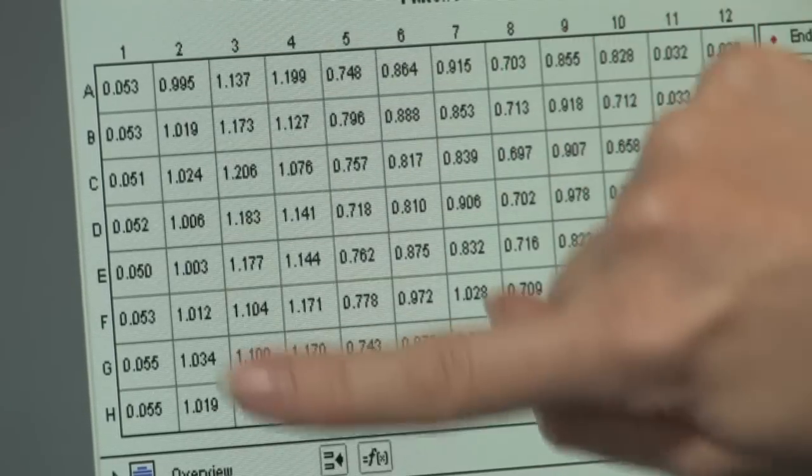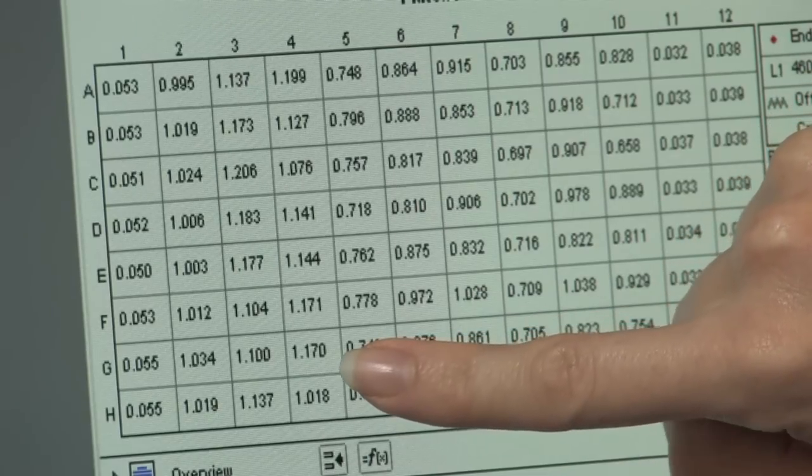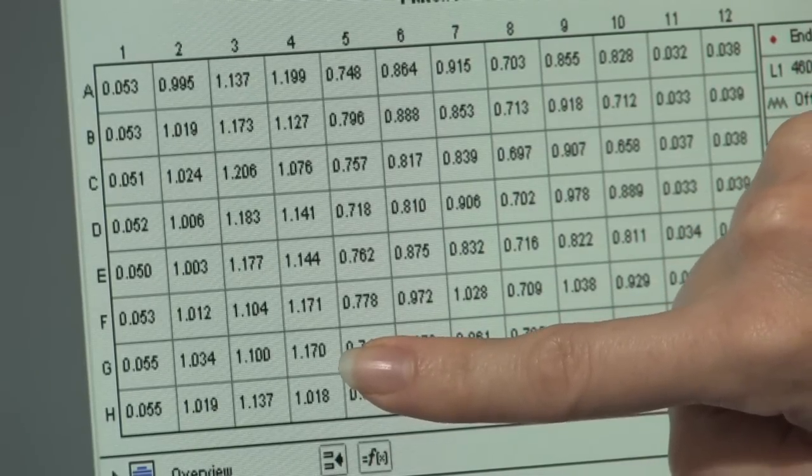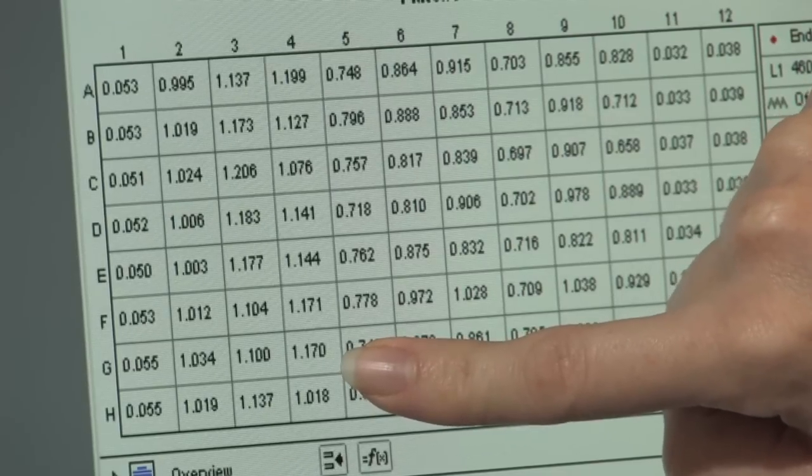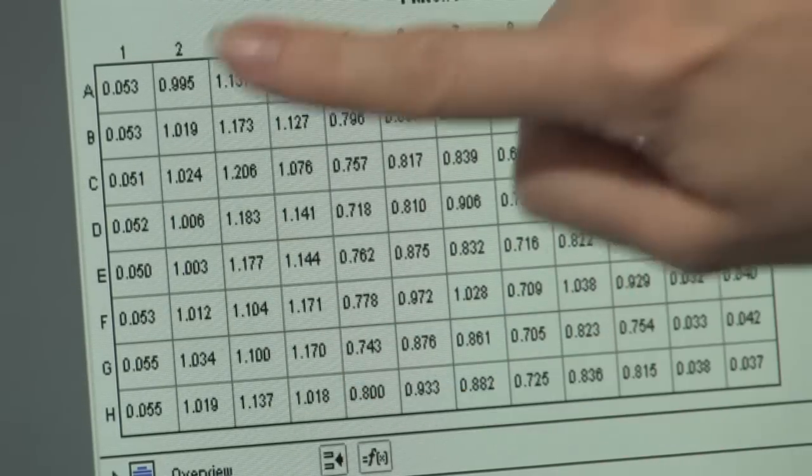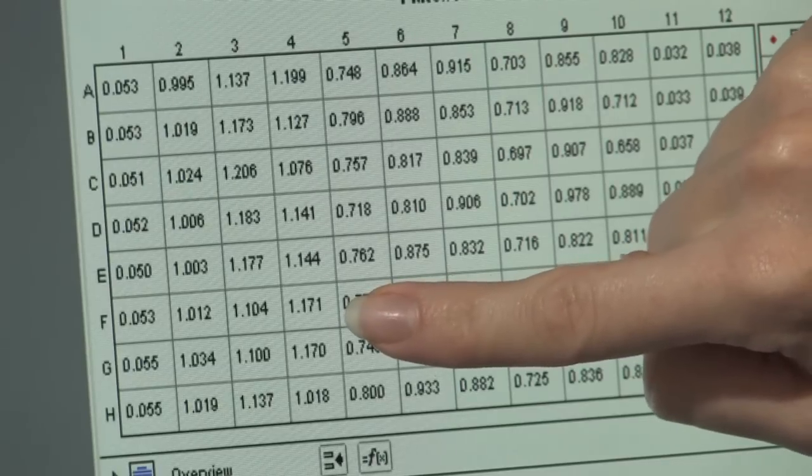In the next two rows, we have about 1.15. These are the rows that represent the DOPA plus soil. So there was phenol oxidase activity as there is a darker color or a higher number within these rows. So this lets me know that there was phenol oxidase activity within my soil.